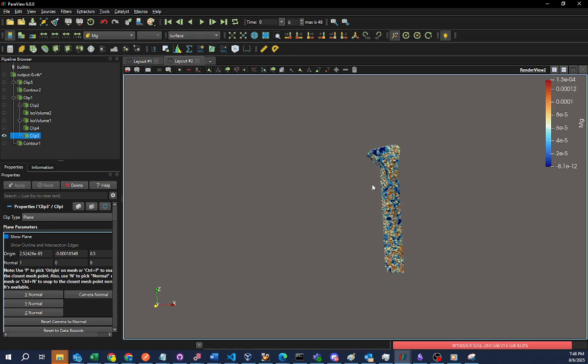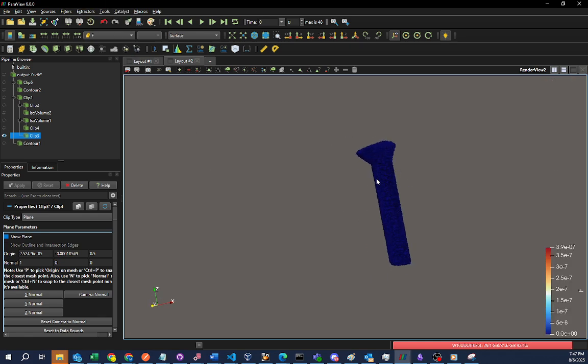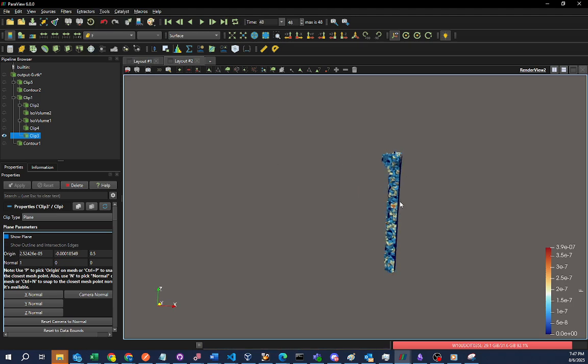This also makes sense. Sometimes on some of the surface of the screw won't be purely magnesium, but the inside will be purely magnesium. The fluorine, this kind of makes sense. The fluorine shouldn't really be inside the screw. But then as the screw degrades, it gets more and more fluorine.